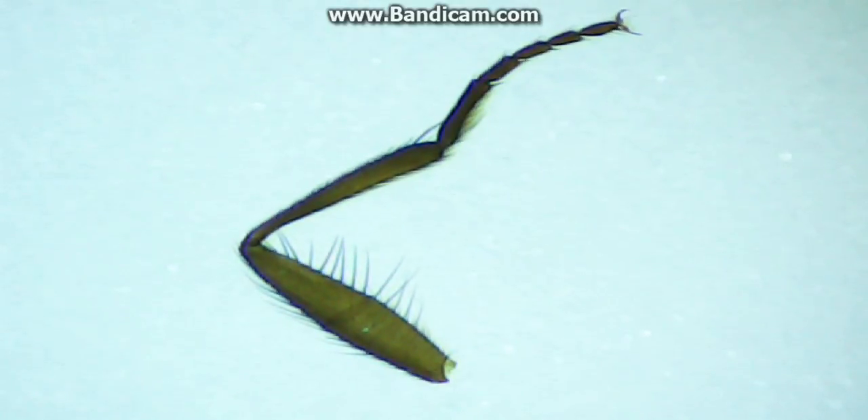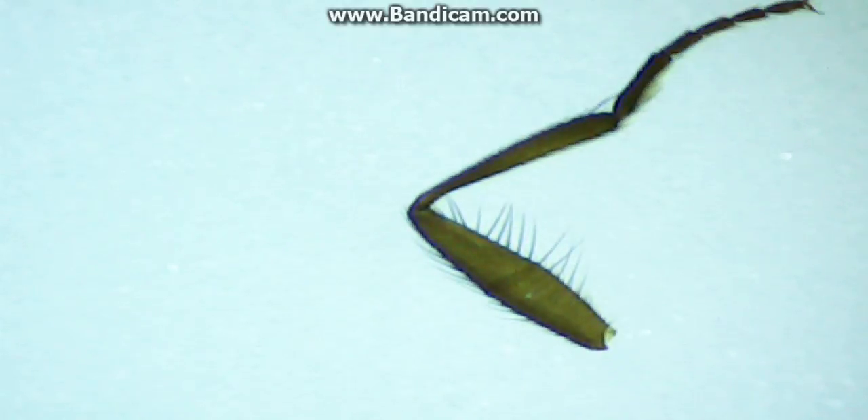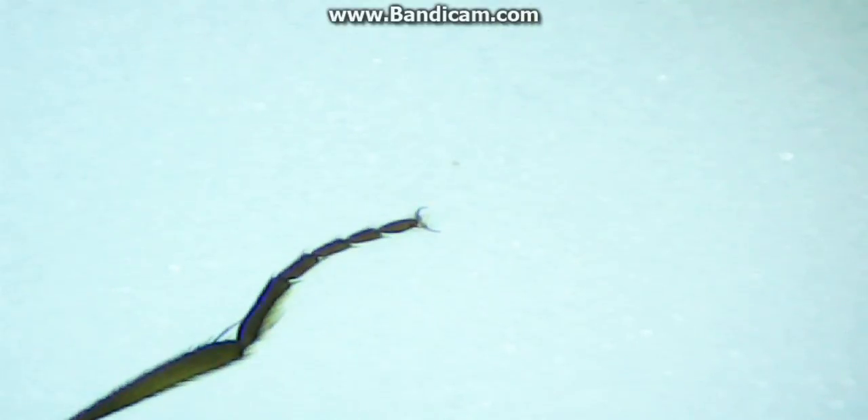Hi guys, and today we've got to show you a common house fly leg under a microscope. Put it under. Let's see what comes up. And now that is fantastic. Would you please do it in there Tom? We want to see the better quality there. Now that is amazing. This is at 80 times magnification now.